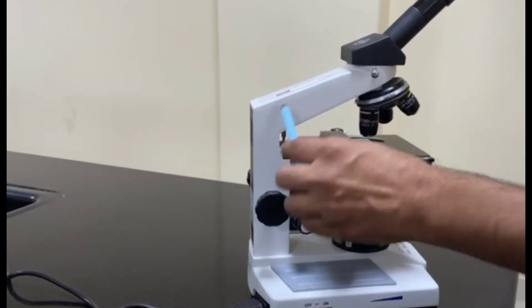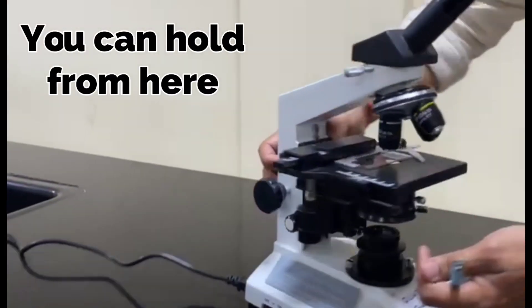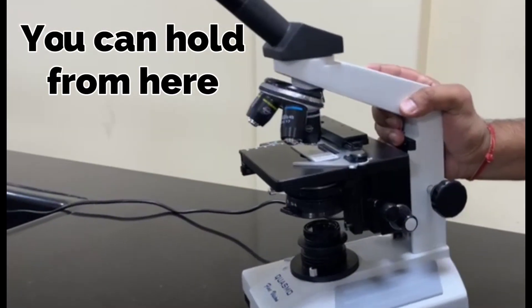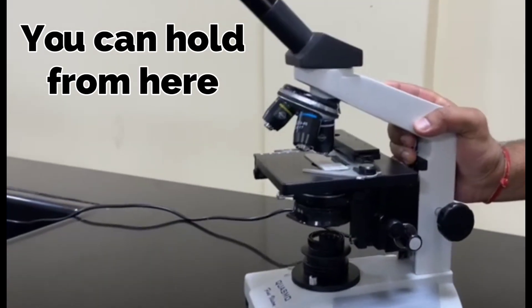This is the arm of the compound microscope. This arm can be used to hold the microscope and transfer from one place to another place.